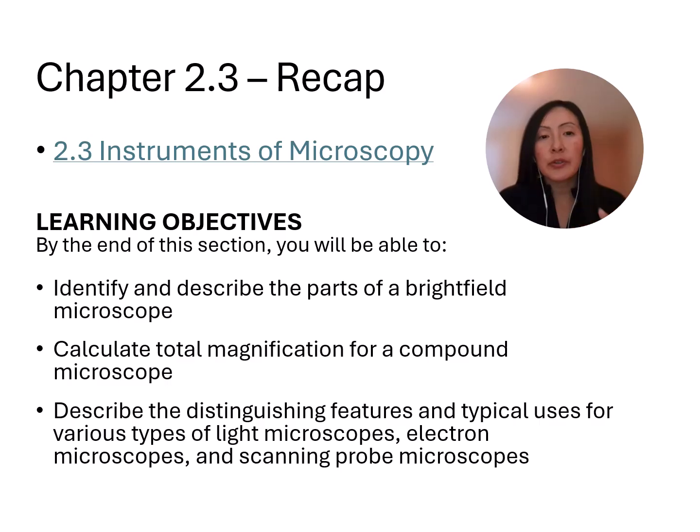All right, gather your notes and make sure you can answer these learning objectives. Take this in combination with your lab handouts, especially that microscope handout that you get in lab, to look at the different parts of a bright field microscope. Can you tell me where and what the ocular lens does? Where are the objective lenses? Where's the stage? What are the XY knobs? What is the condenser? What's the rheostat, for example?